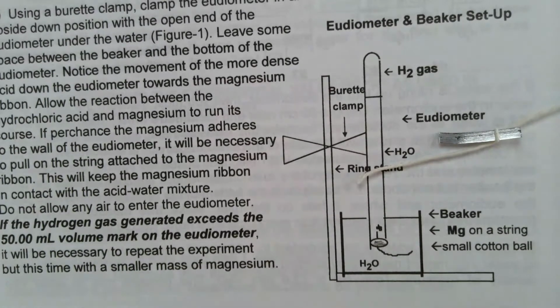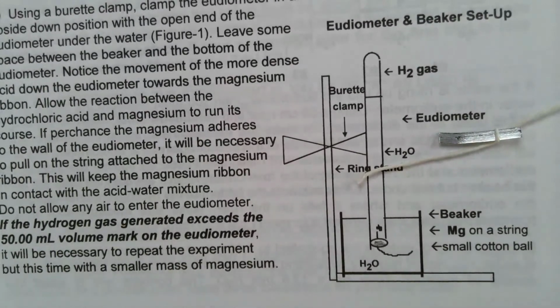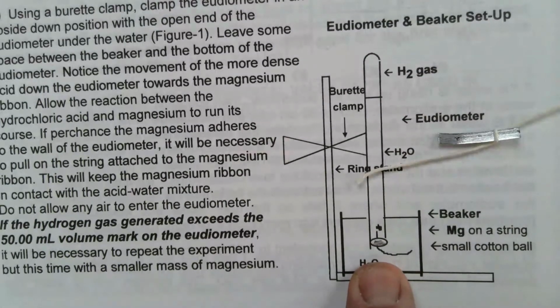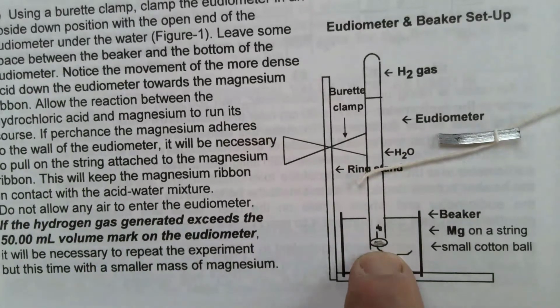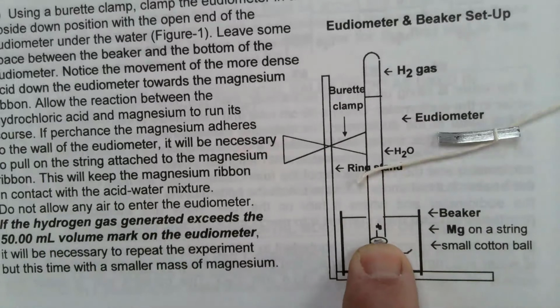The reason for the string is because the magnesium is so light, when you put it in water, it would go right to the top of your eudiometer and stay there, so you wouldn't get a reaction. The cotton ball functions merely to hold the string in place. Neither of them is needed for the chemistry, but they're functional in this experiment. The cotton ball holds your string in place, and the string holds your magnesium in place.